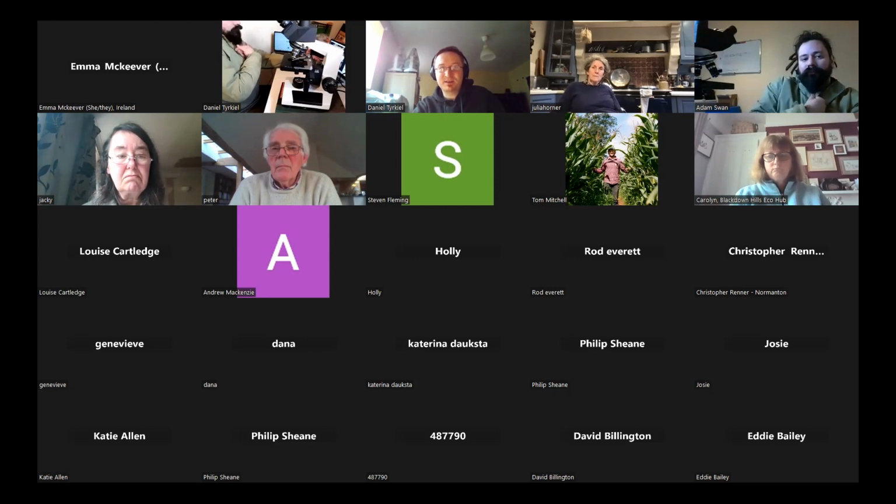Emma has got her hand up. Sorry, I don't want to keep you too long. Hi, I was just wondering how far along you have maybe got with pairing your microscope assays with genetic testing.